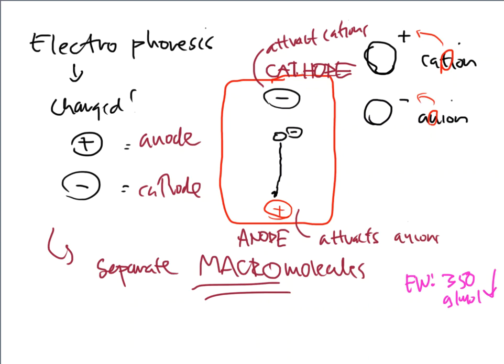So if we take a look at various salts that we are measuring out and dissolving in water, if we're looking at various organic flammables like toluene or xylene or dichloromethane, those are very often low molecular weights. If we're looking at our health hazards, our oxidizers, our acids, our bases, everything that's mainly in our laboratory area, those have lower molecular weights. And those are the things that we use all the time.